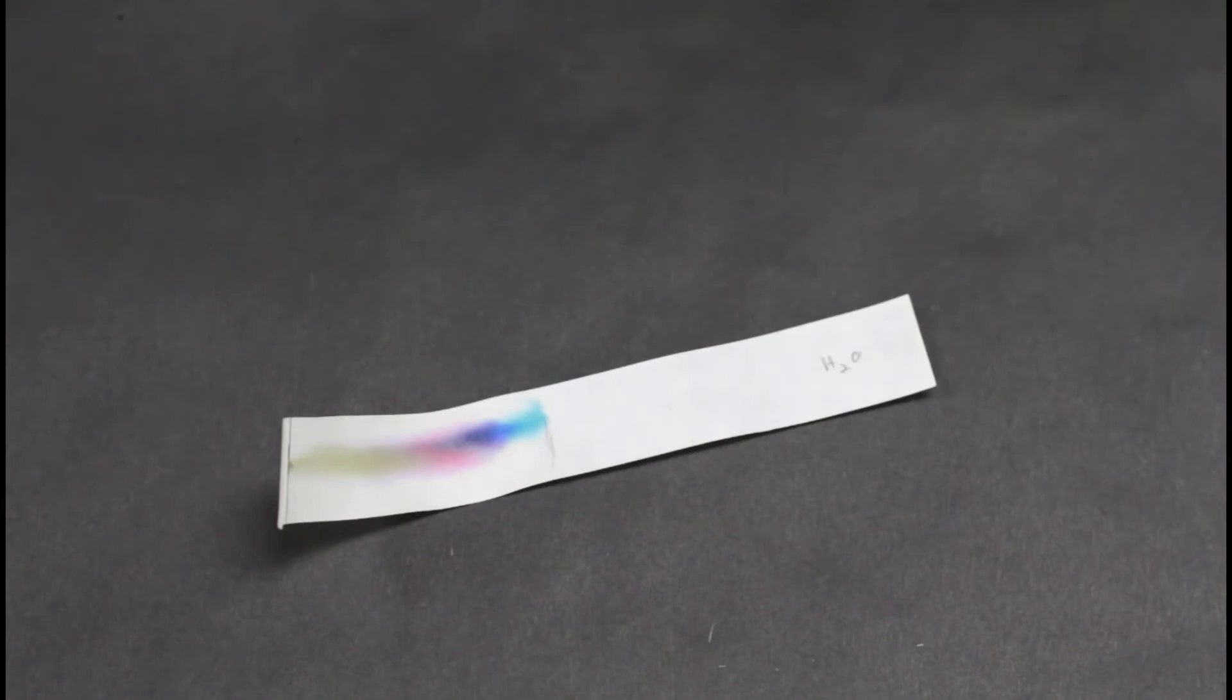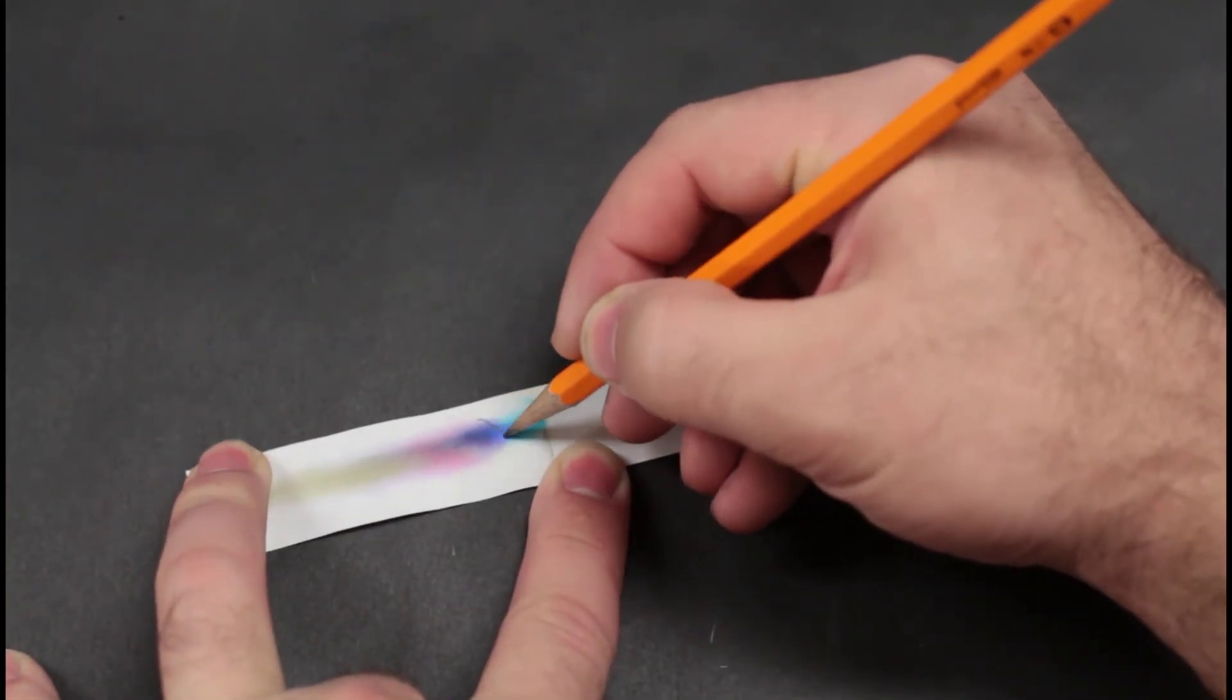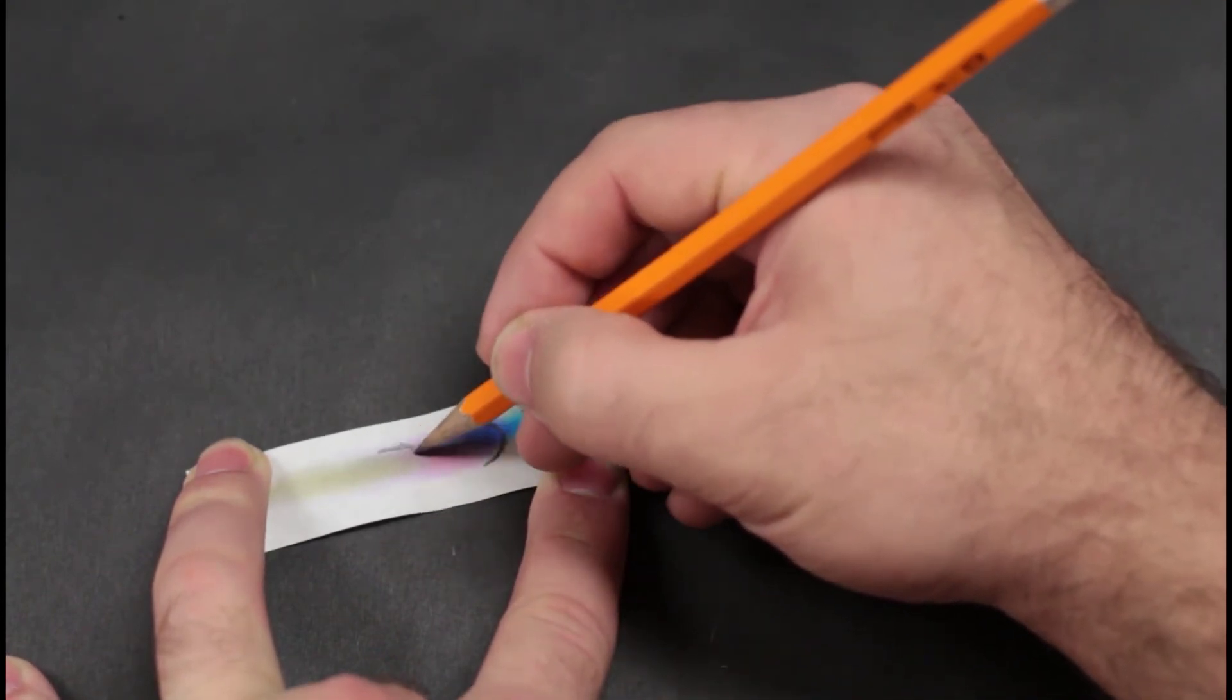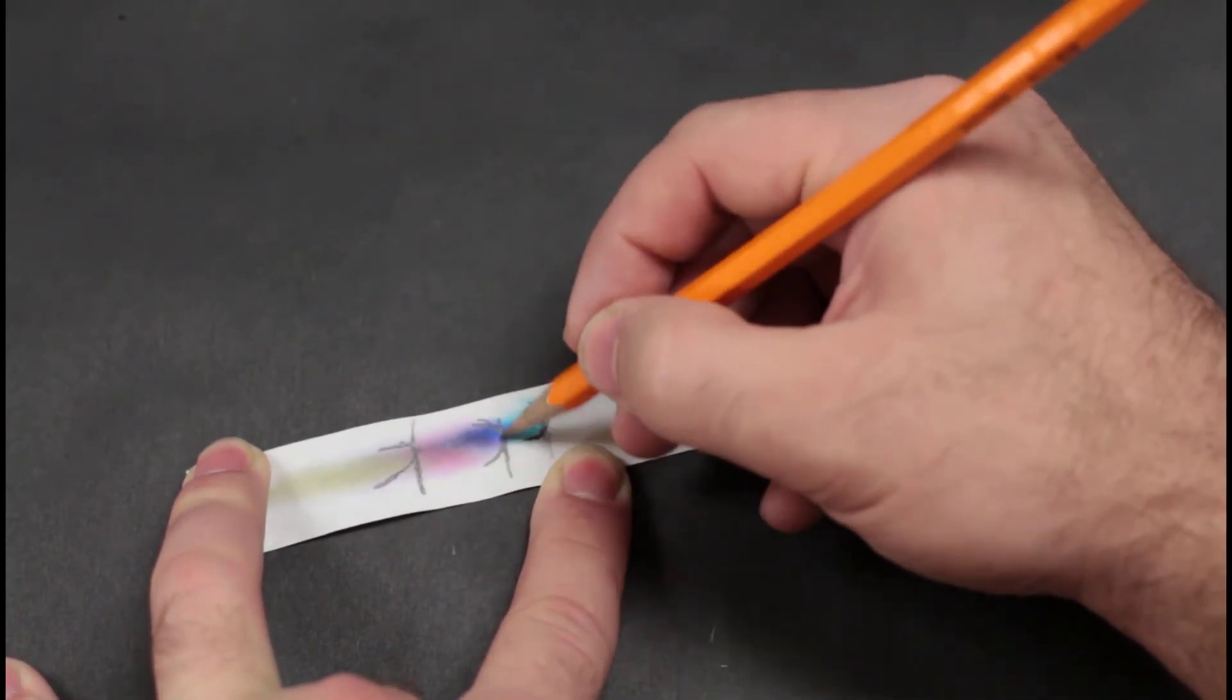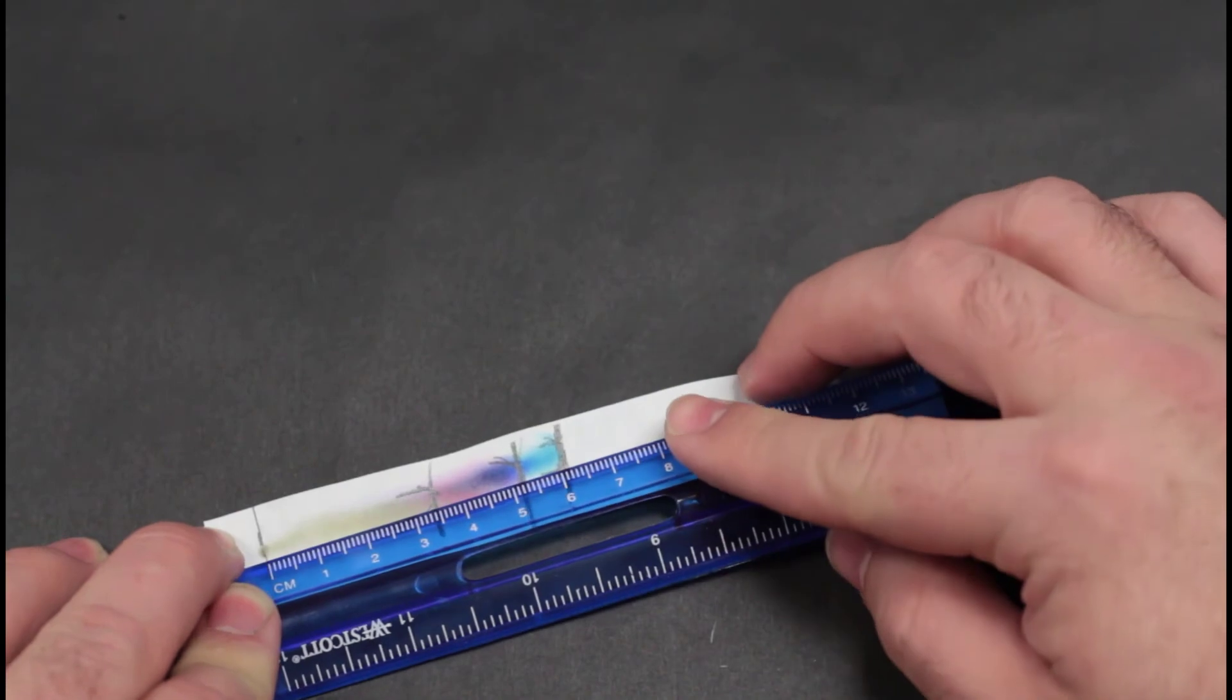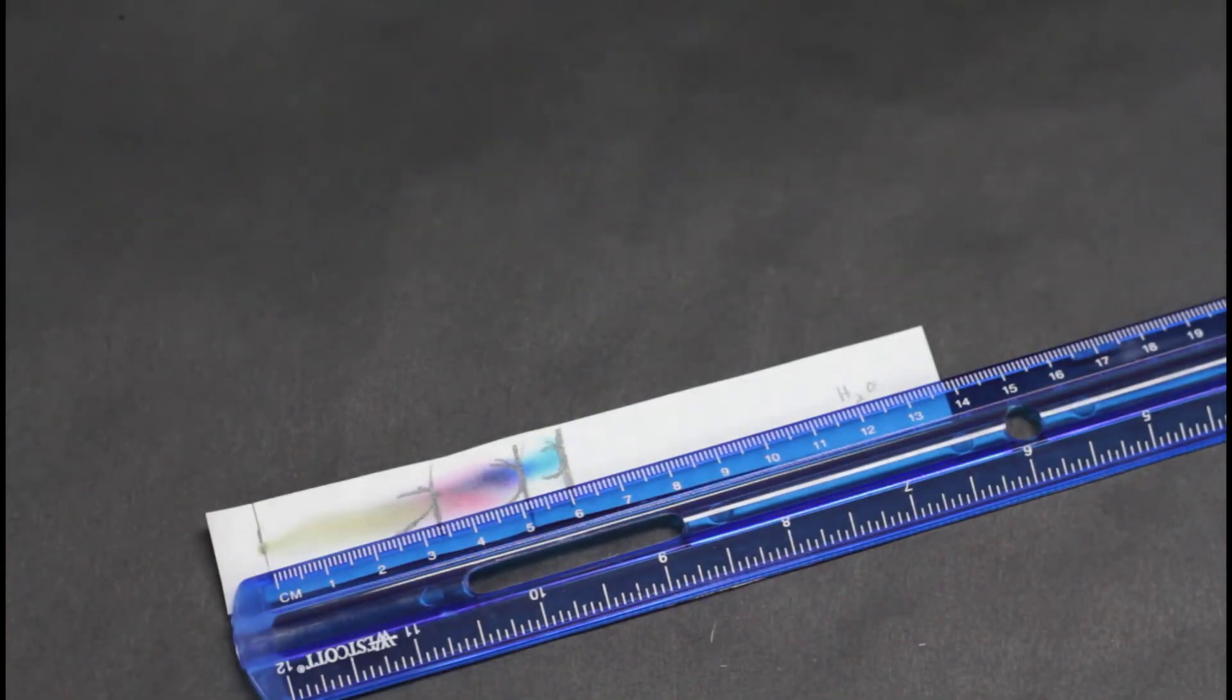To measure the RF value, we will make a ratio of how far each pigment traveled divided by how far the solvent traveled. That'll make more sense when we go over the calculations. In my example, notice that the blue pigment traveled 6 centimeters, the red pigment traveled 5.2 centimeters, and the yellow pigment traveled 3.4 centimeters. Let's determine our RF values for those colors.